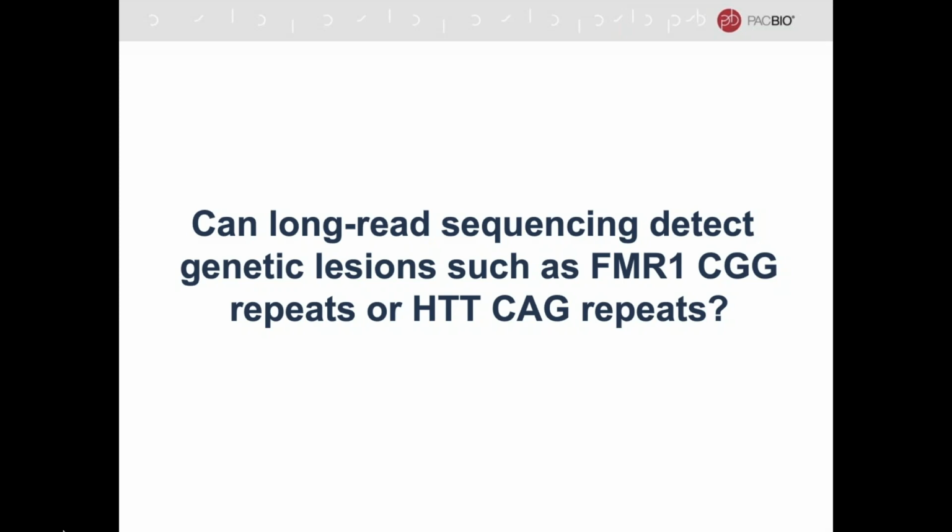And just to comment, that is for the native DNA, so the no-amp method, the whole genome sequencing. As you amplify, you erase those epigenetic marks. But it's known in the case of FMR or suspected that epigenetic modification is critical for the pathogenesis of disease. So I think that's a very good comment. It's an added benefit you get from every sequencing run of native DNA on the platform. Absolutely. Thank you for that.